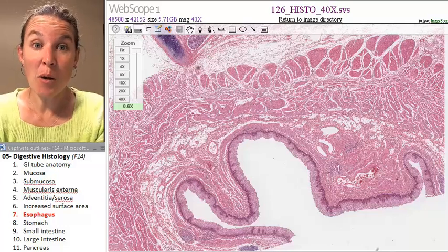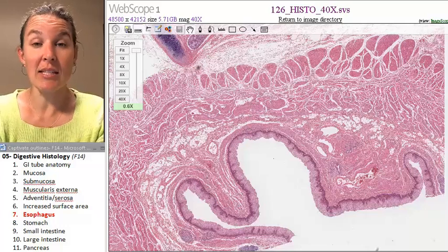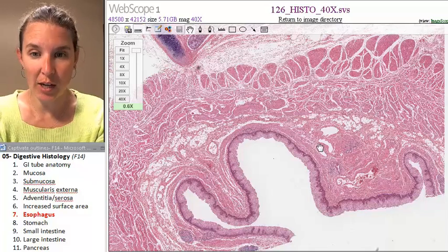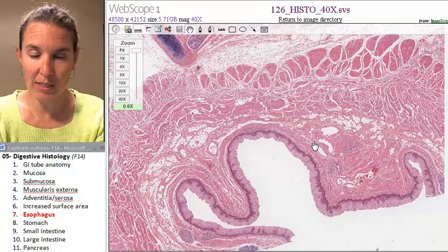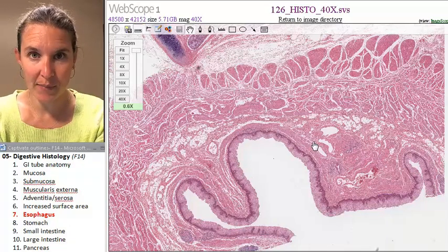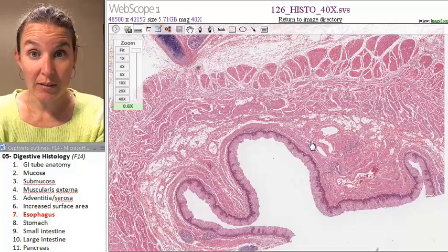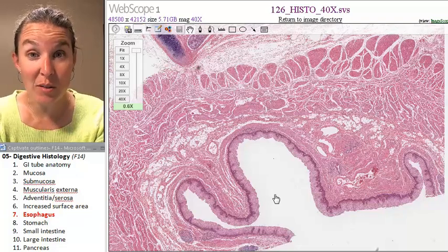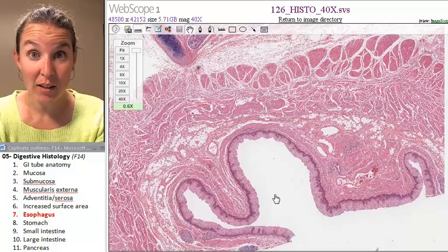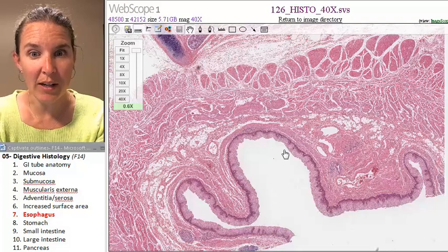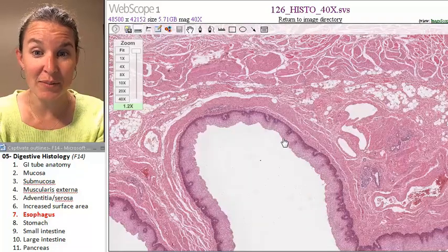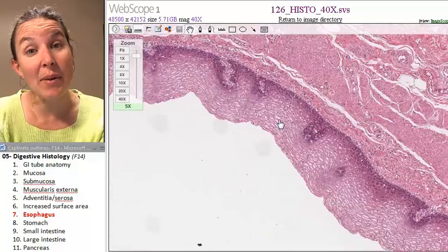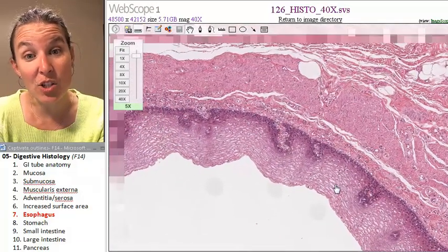The esophagus might be the easiest part of the tube to identify. Check out this slide. Do you see a lumen? I can't draw on this, but here is my lumen. What are we going to expect to find next to the lumen? We're going to expect to find epithelial tissue first.